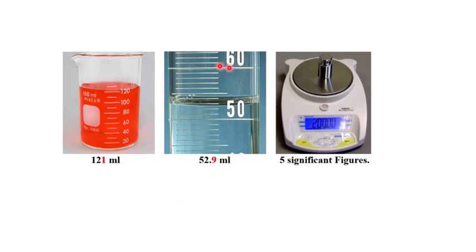If we look at the next one with a graduated measuring cylinder, it's more accurate, but there's still uncertainty. It's clearly 50, 51, 52 milliliters in volume, but it hasn't quite reached the marking for 53. And so here's where uncertainty comes in again, between 52 and 53, and because the lower edge of the water level at the bottom is almost at 53, a final value of 52.9.